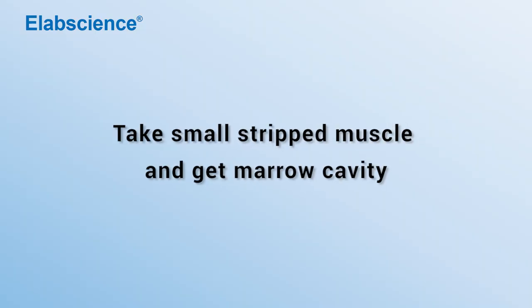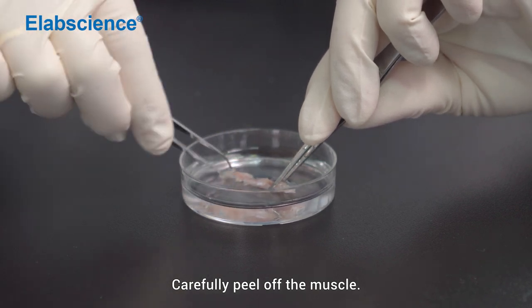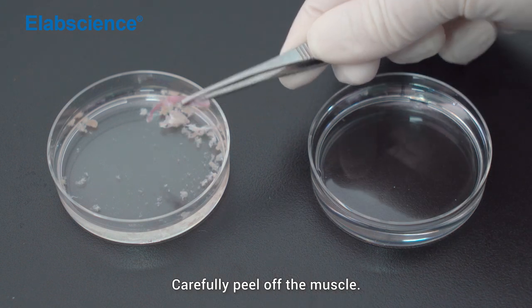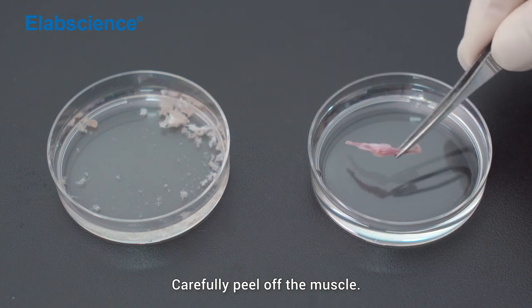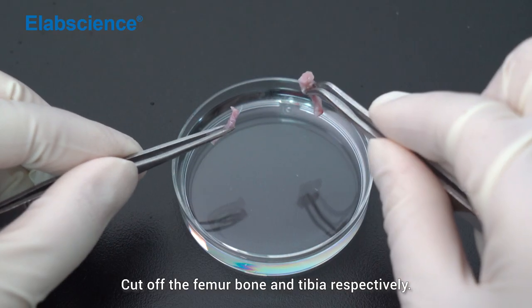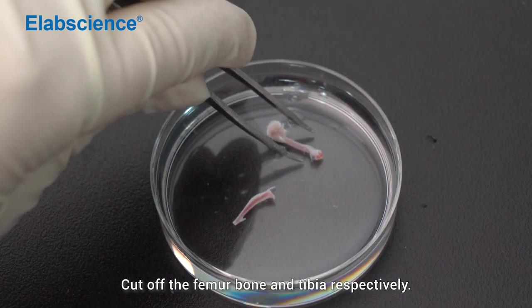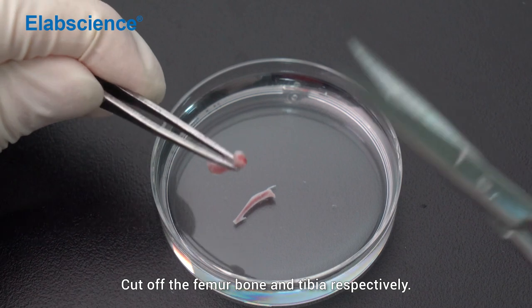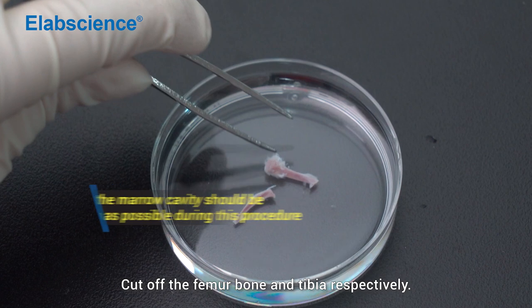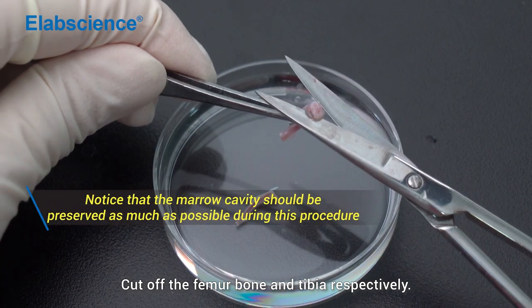Strip the small muscles to access the marrow cavity. Carefully peel off the muscle. Cut off the femur bone and tibia respectively. Remove the femur bone.